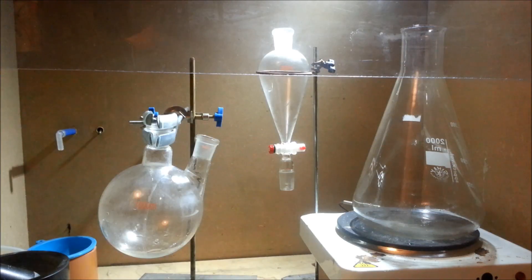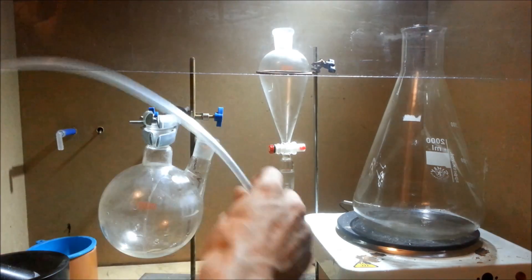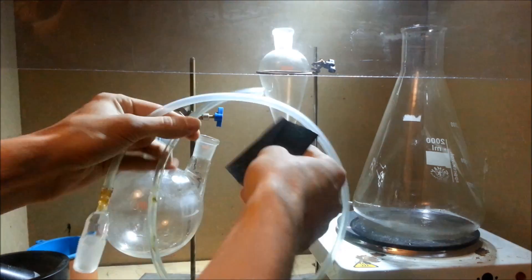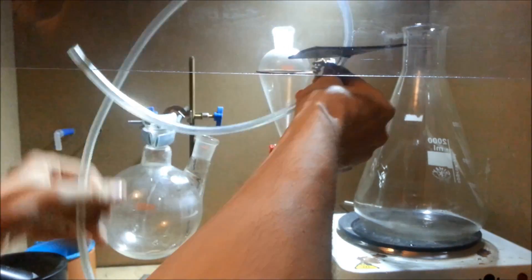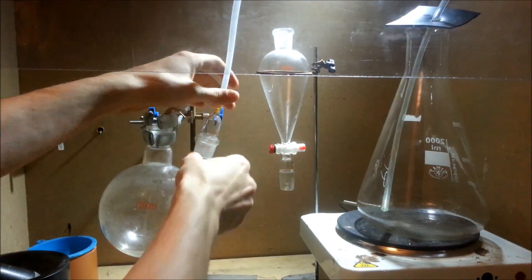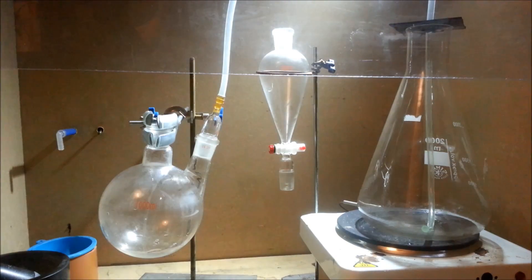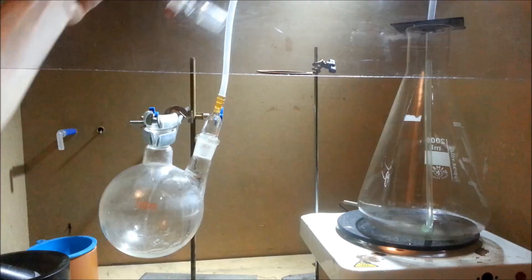A 1 liter round bottom flask was fitted with a PVC hose, which was then fed through a makeshift rubber lid, going down into a 2 liter Erlenmeyer flask. A separatory funnel was then placed atop the round bottom flask.